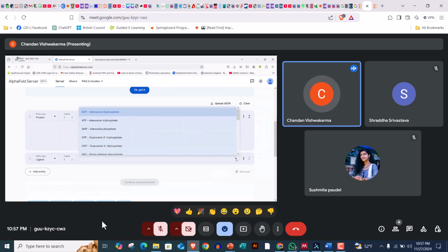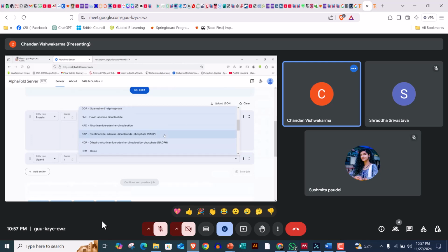Go to action here, go to this one, and then find NADP or NADPH. This is NAD, the oxidized form, so it does not work. This is NADP, also the oxidized form. This is the reduced form, NADPH. You can look at the interaction from all three, you get the same interaction. No problem. For now I am using NADPH.